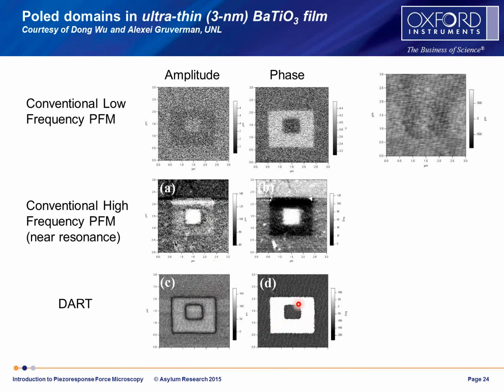And then these were made sequentially at the same location using DART. This is the amplitude, and this is the phase here. The phase shows a very nice 180-degree phase shift, very high signal to noise, very crisp domain delineation. And the amplitude signal, the amplitudes on the inside and outside are approximately similar. There's a beautiful zero at the domain boundaries for both the inner and outer domains, and the signal to noise is quite nice in this case. So I really like this example.